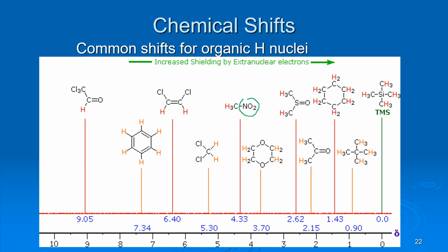Benzene rings are pretty de-shielding, and we'll talk a little bit more about them because they've got all these double bonds, and so they're pulling electron density away from the hydrogen. Benzene rings tend to have hydrogens at around 7. And then you can see here a hydrogen directly attached to a carbonyl group has a pretty high shift. There are actually probably a few that might be even a little higher, but you get the idea. The more electronegative the elements, the further to the left you're going to be. And a lot of it's relative at this point.